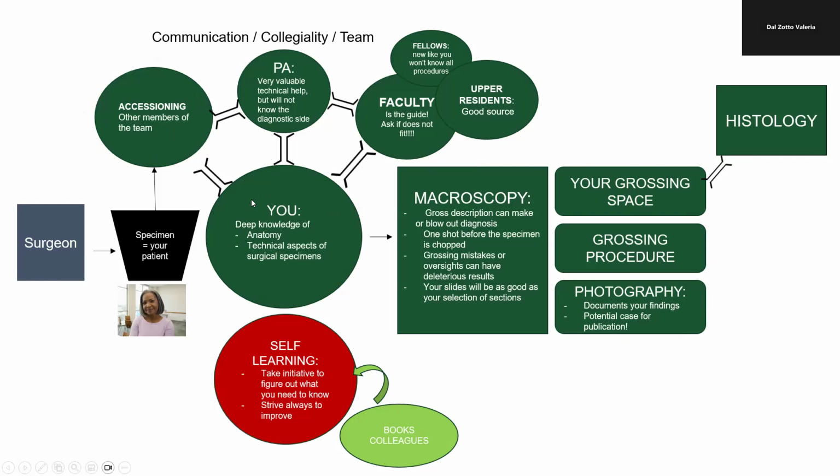At the same time, you are going to interact with several people in the gross room. One group is the PAs. Keep in mind that the PAs are a very valuable technical help, but they will not know the diagnostic side. You are in charge of the deep knowledge of anatomy and technical aspects of the surgical specimen. Also, you are going to interact with the faculty. The faculty on the service that you are grossing for is going to be your guide.